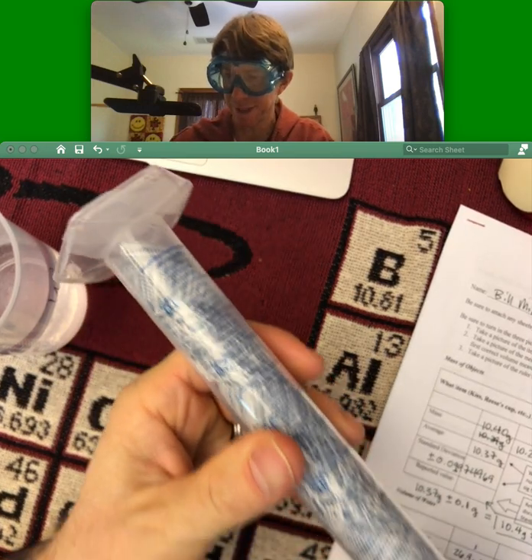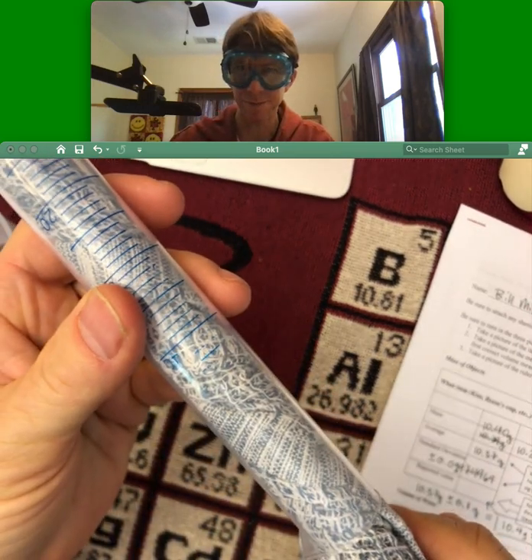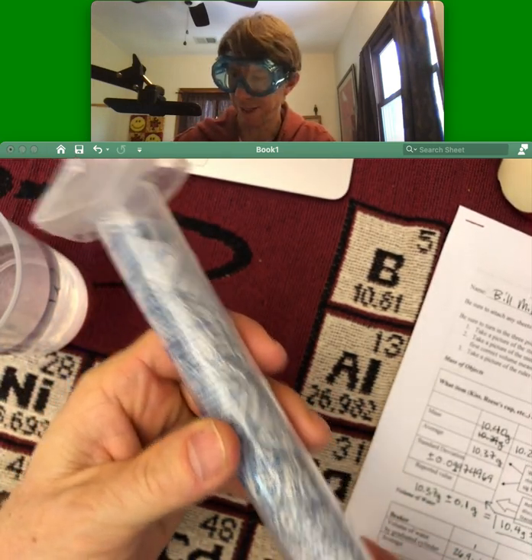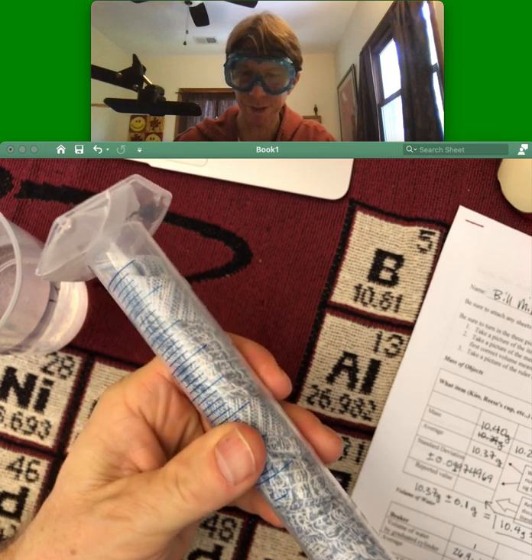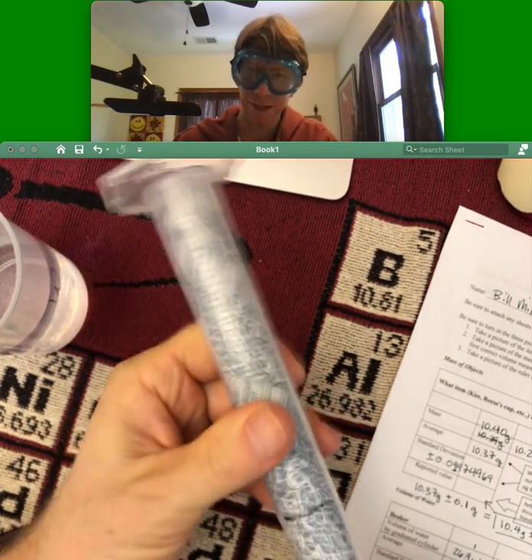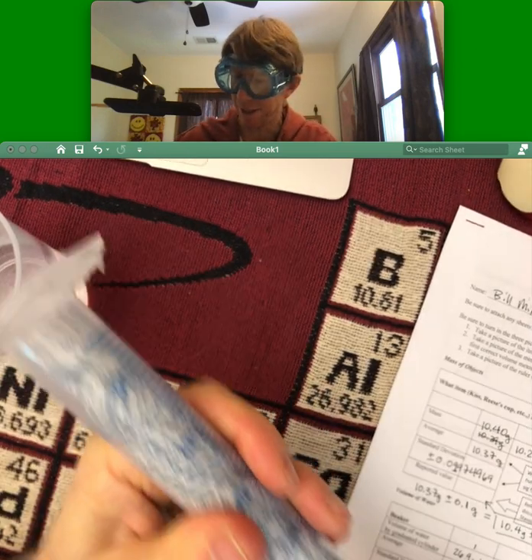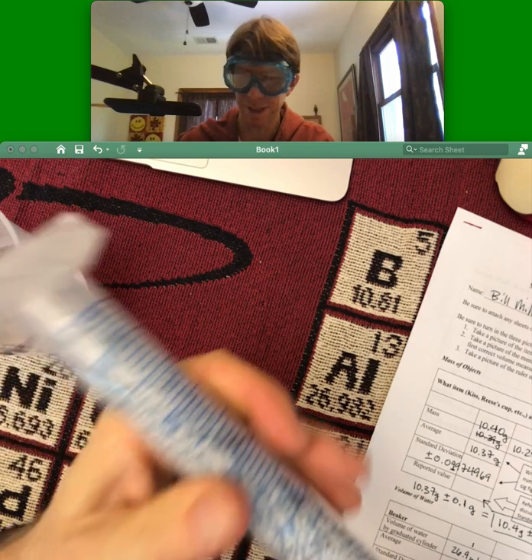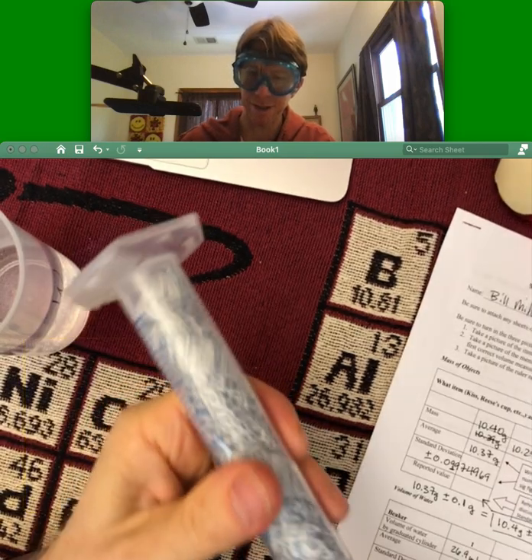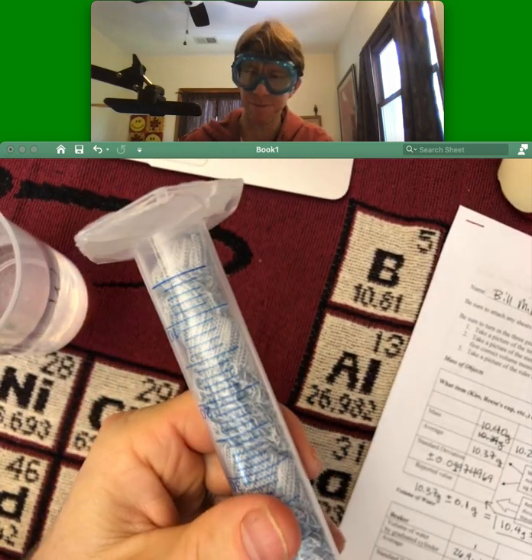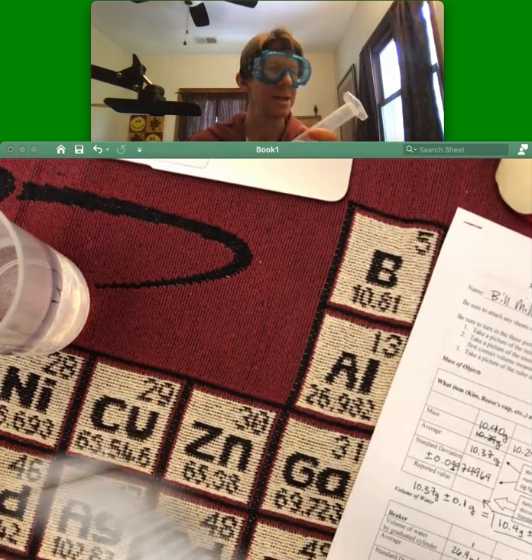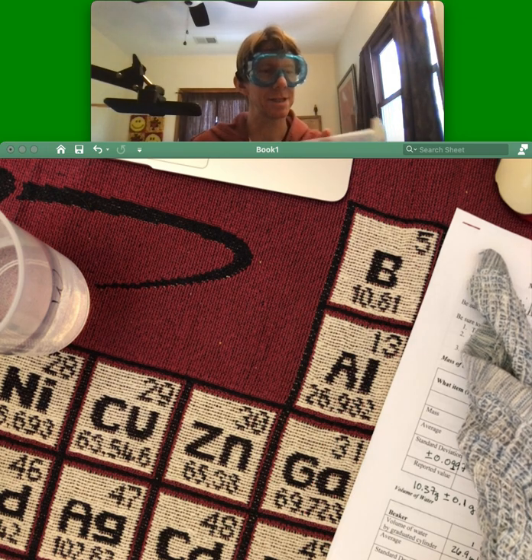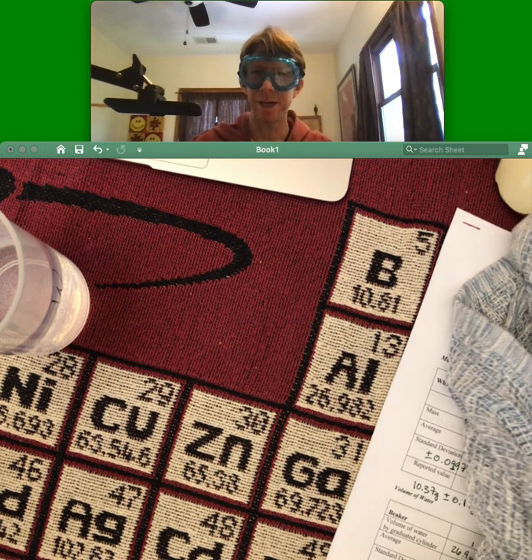I dried it off, and you can see that towel got all the way, that hand towel got all the way down in there. I twirled it until I got all the way down in there, swirled it all the way down.